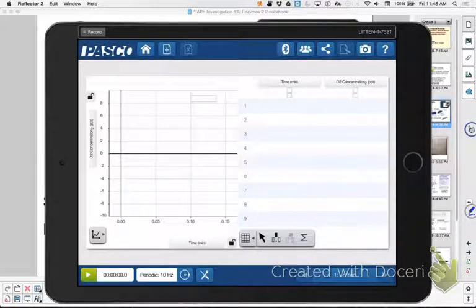This is a little 1 ml syringe. So now I'm going to put in 0.5. And then I need to be ready to hit play right away. Okay, so I'm putting it in. I'm going to put on this. And I'm hitting play.